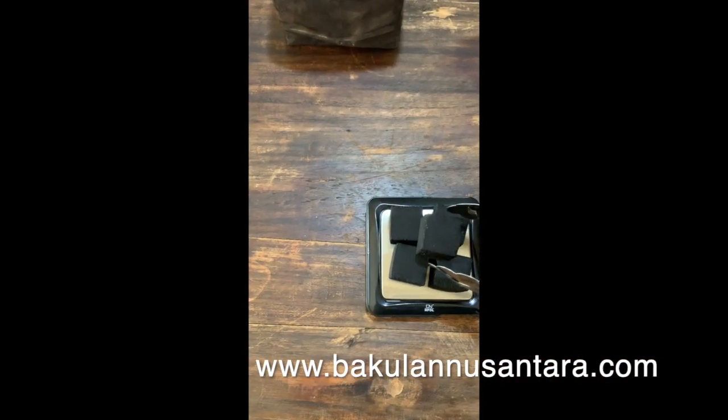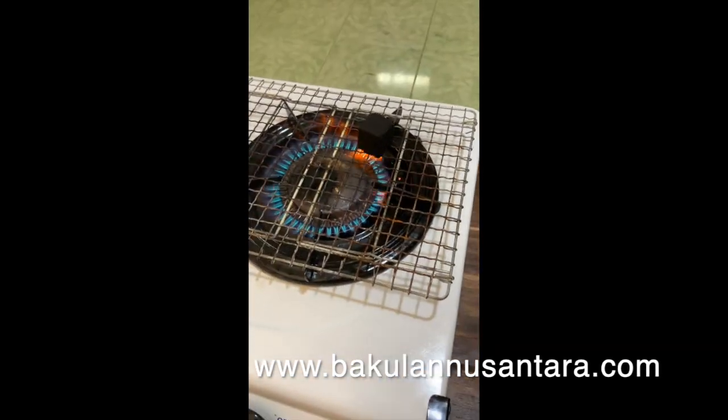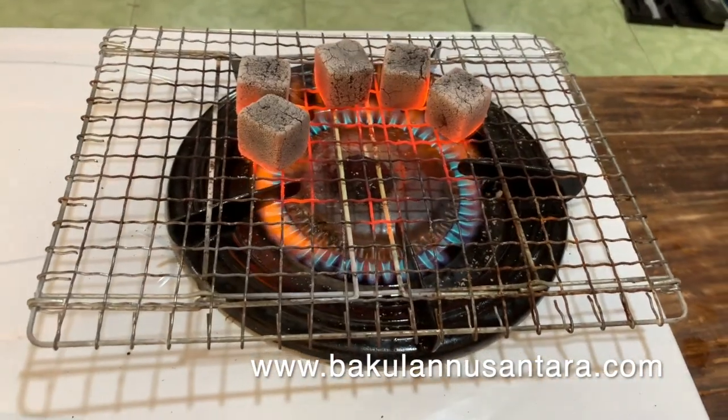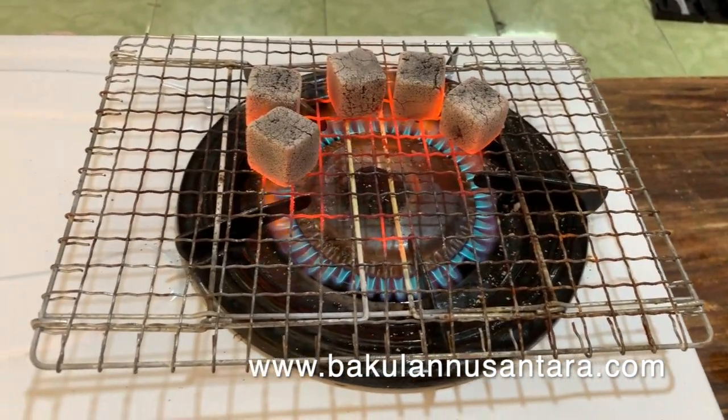Now we'll take those same five cubes and ignite them. It's been about eight minutes and our briquettes are fully alight. Ignition time will depend on the power of your ignition source, humidity, temperature, etc.